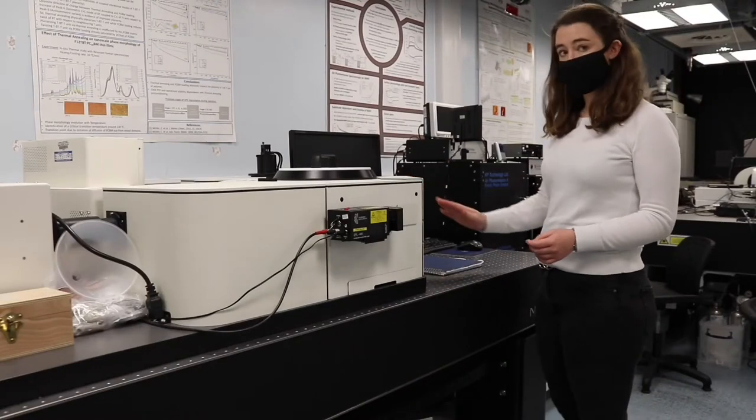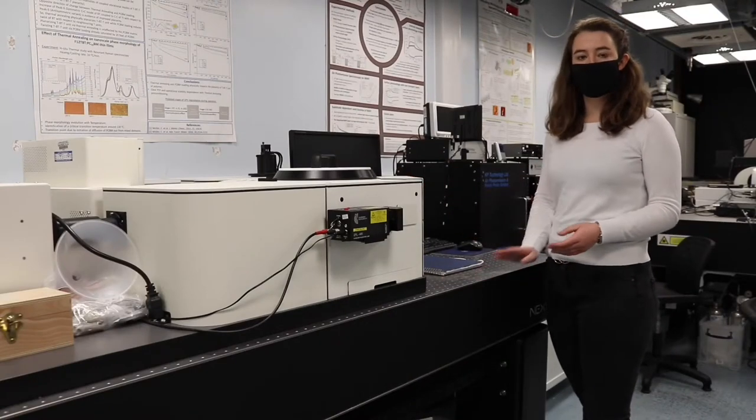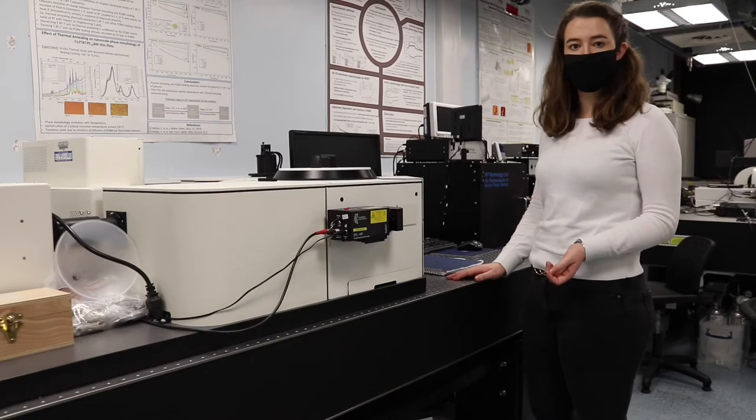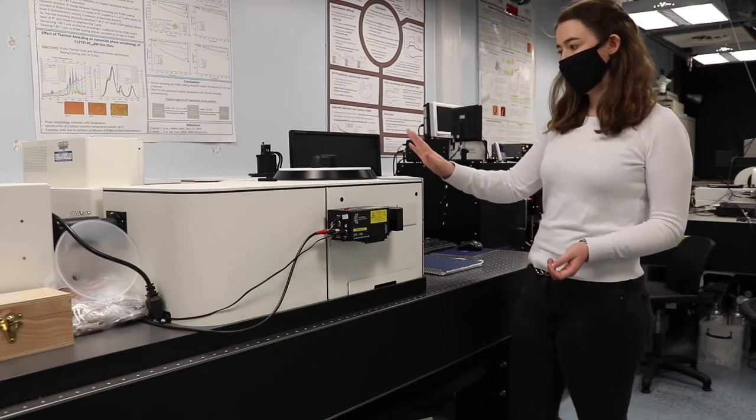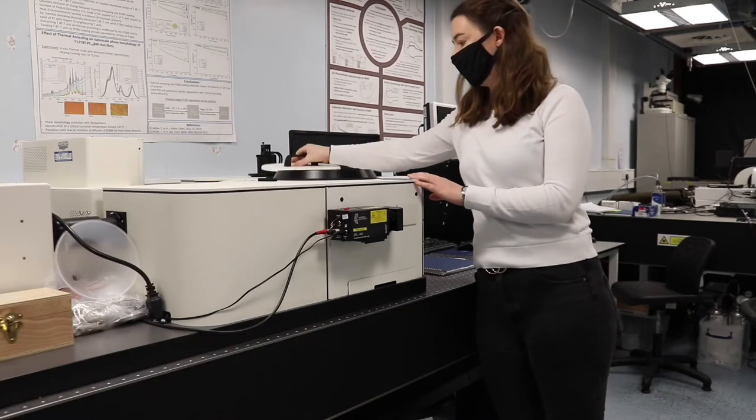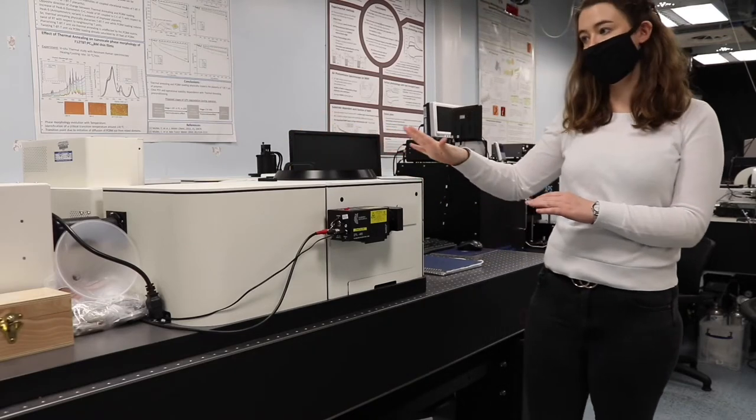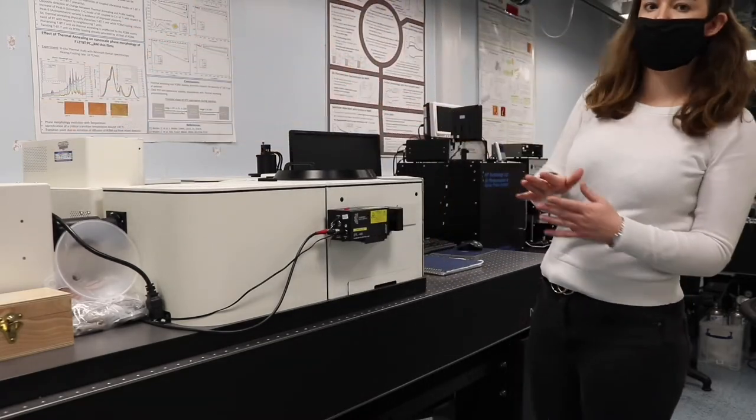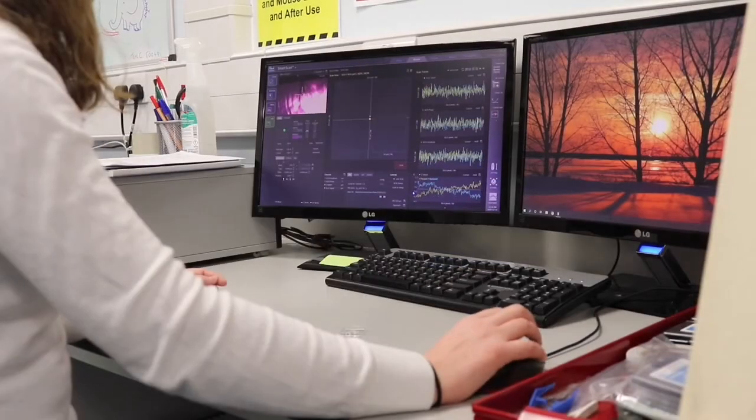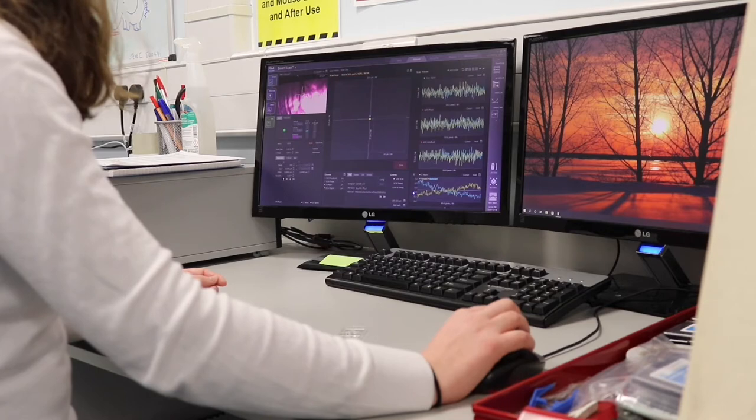This is a fluorospectrometer so we use this to do photoluminescence measurements and also time correlated single photon counting. We can do this with thin films mostly just in the sample chamber for steady state. We also have this cryostat which means that we can measure at very low temperatures and we can control the temperature right up to around 300 degrees.